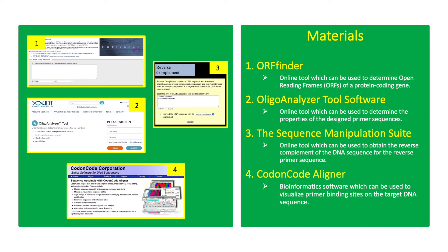The materials for this activity are online open-source bioinformatics platforms. ORF Finder is used to determine open reading frames or ORFs of a protein-coding gene. OligoAnalyzer tool software is used to determine the properties of the designed primer sequences. The Sequence Manipulation Suite is an online tool used to obtain the reverse complement of the DNA sequence for the reverse primer. Codon-Code Aligner can be used to visualize the primer binding sites on the target DNA sequence.